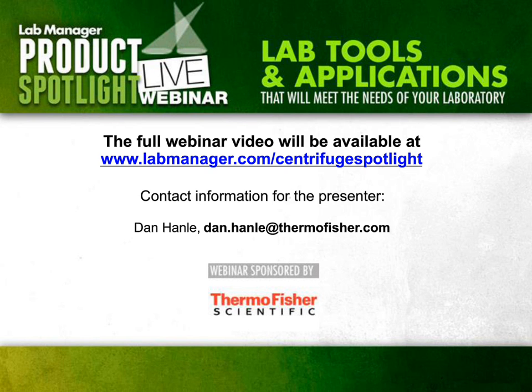I just mentioned at the beginning, their research is changing. To buy a centrifuge 10, 15 years ago when the research has changed so dramatically is another reason to rethink when it's time to get a new one. And one of those could easily be that they've got some new filter-based tube system that just came out last year and it doesn't quite fit right in the centrifuge or the rotors and adapters we have, and either can we find a different one or can we adjust would be something that we encounter probably once or twice a year as well.